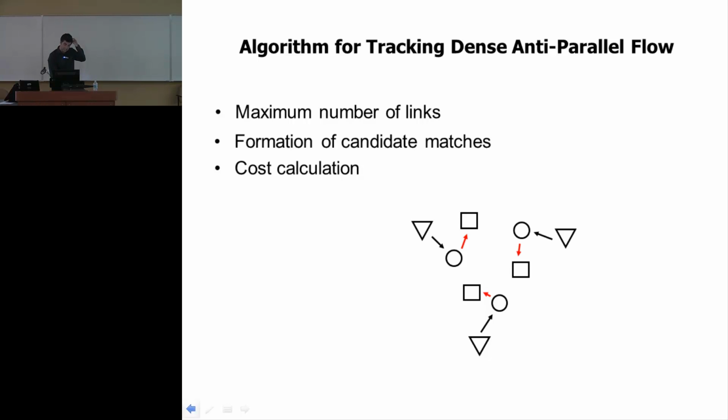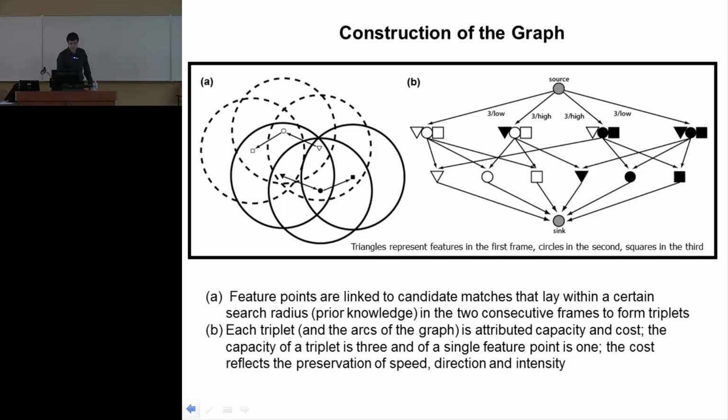So we can appreciate immediately that in the case of these microtubules that are rigid polymer structures, we cannot have this scenario. So we would like to have a solution that offers such links. But also in the case of these spindles that I just showed, we know that they have this anti-parallel motion. So such a scenario when we have 90 degrees would not be possible. So basically what we need here is to introduce local and also global models of motion.